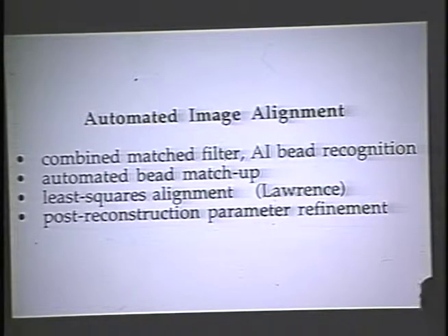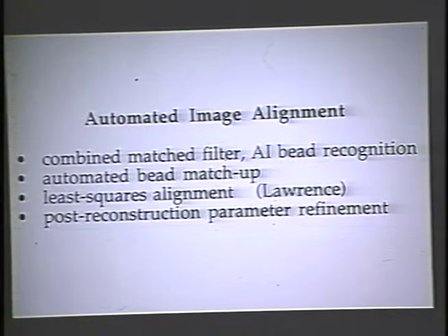The next task, okay, is to put all these images together. As I said, after a day at the microscope, you'll end up with 120 images, roughly 300 megabytes of digital data. And what you have to do is assemble all that into a coherent view.